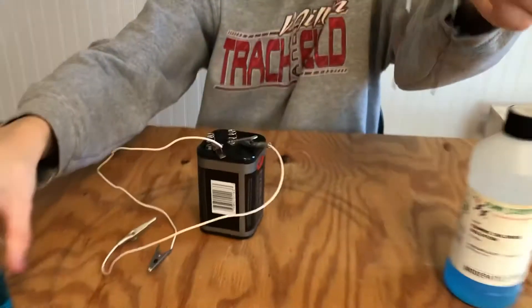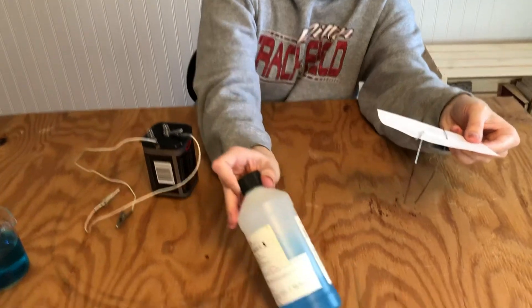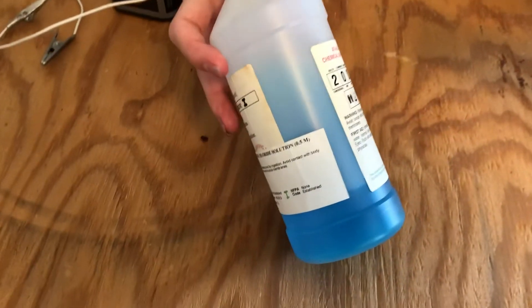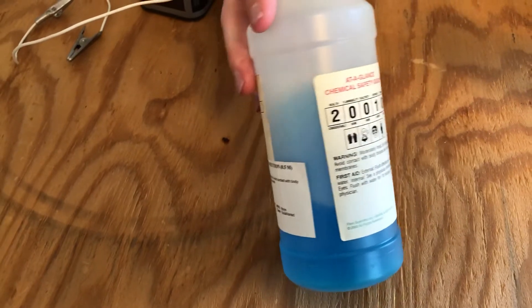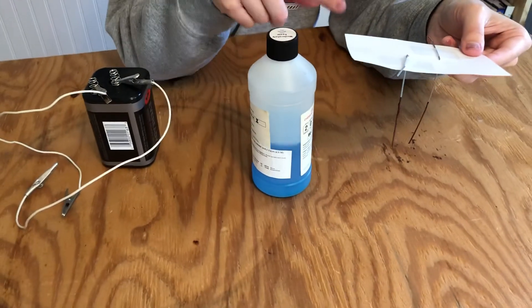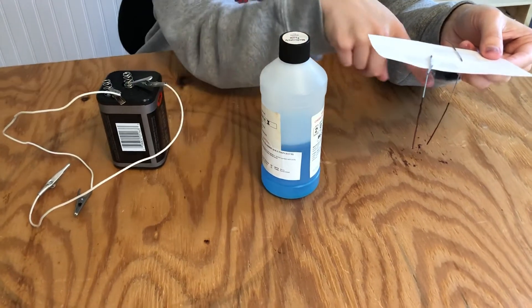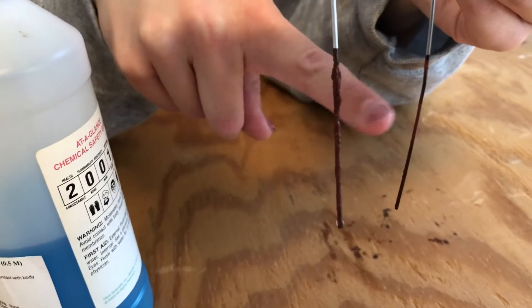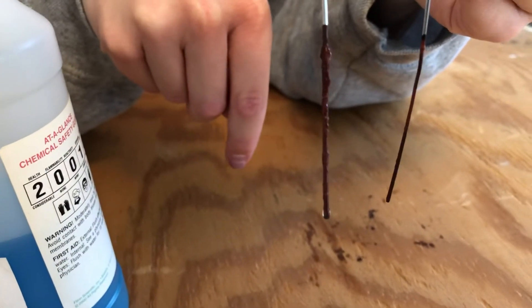The last thing that I want to show you is all three of the compounds for the solutions that we've worked with today. This is the cupric chloride solution that we started with. In the process of electrolysis, theoretically, we separated the copper from the chlorine. Now, taking one last look at our electrodes, which one do you think holds all the copper and which do you think holds all the chlorine?